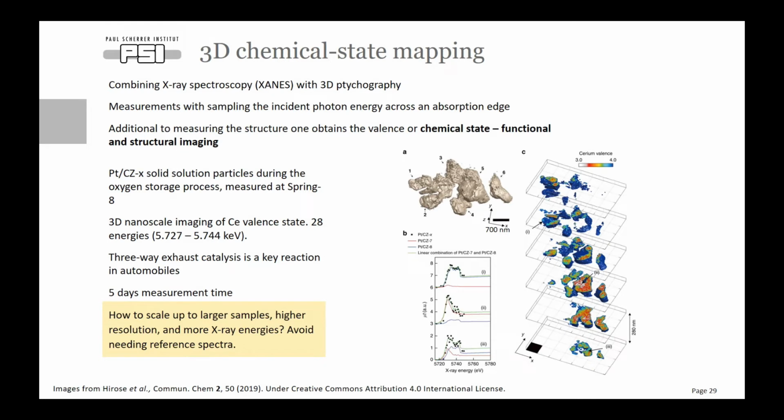And so what we wanted to do is to take this approach and figure out a way to scale it to larger samples with higher resolution, with more energies, in order to avoid the need of having these reference spectra, because it's not always feasible to have these spectra for all materials.